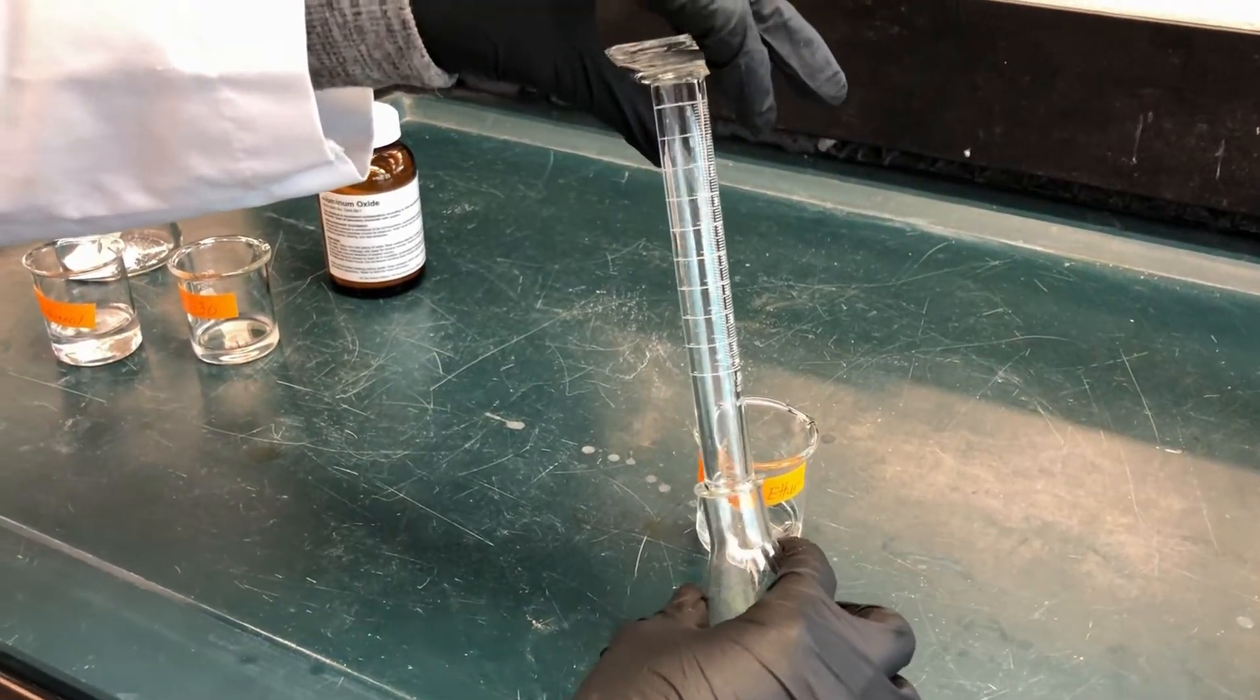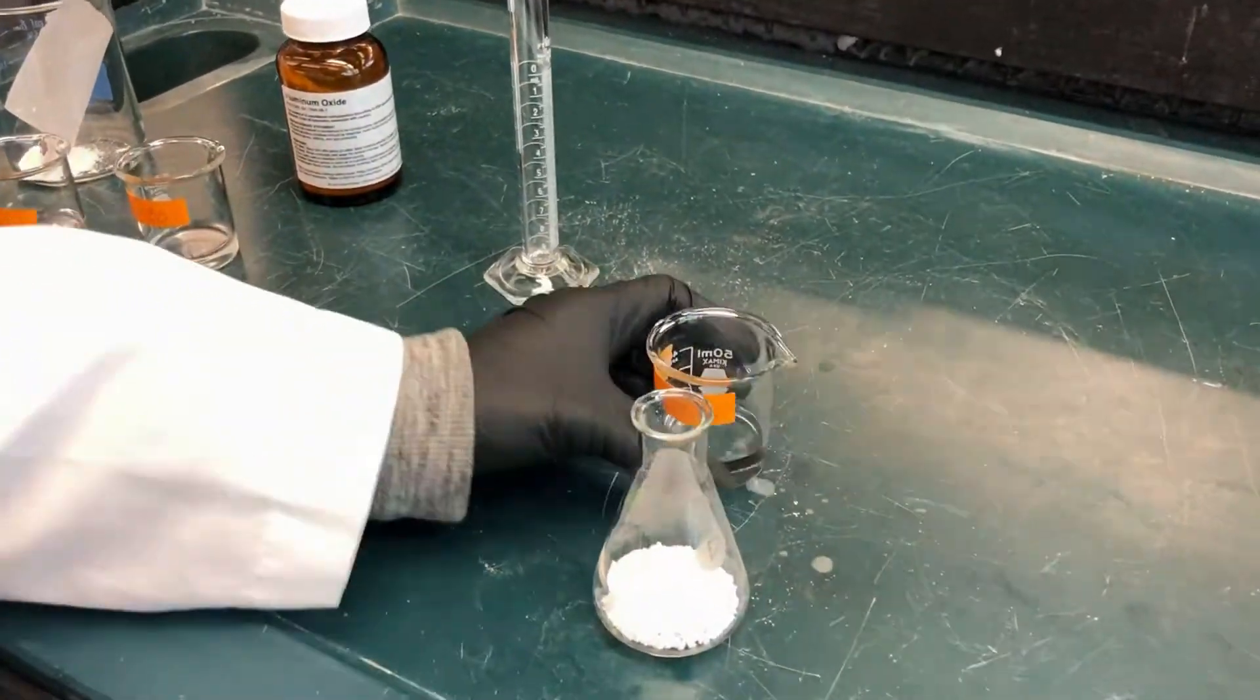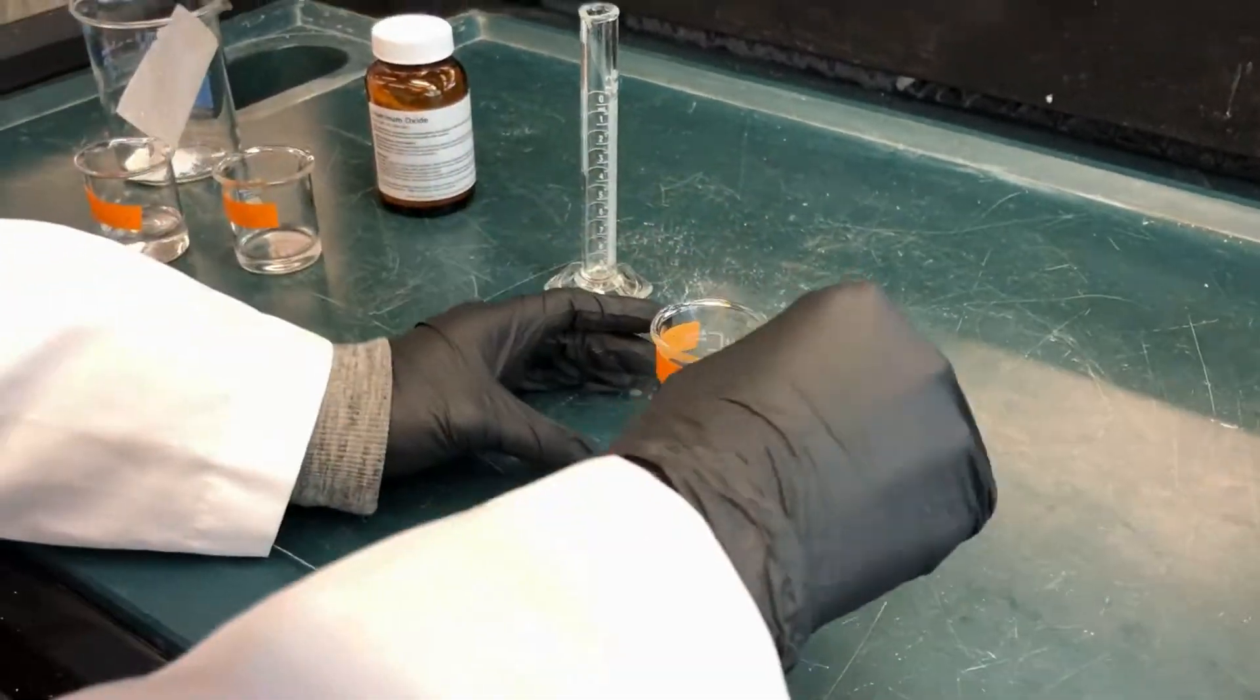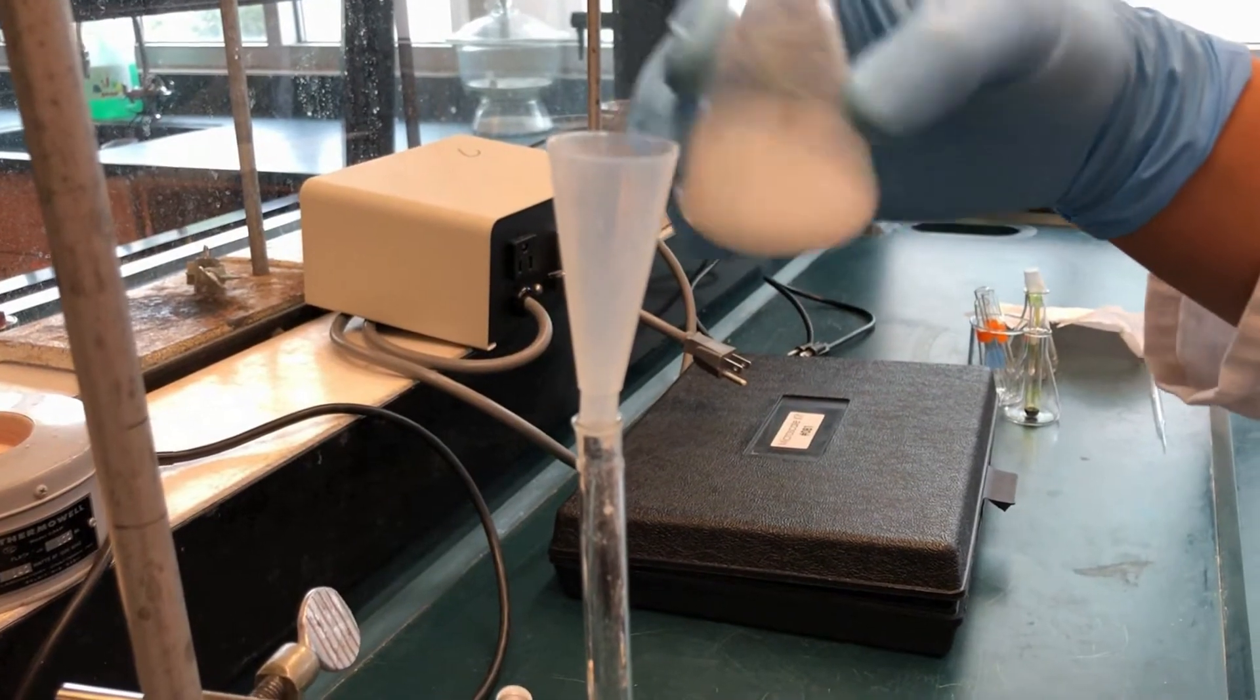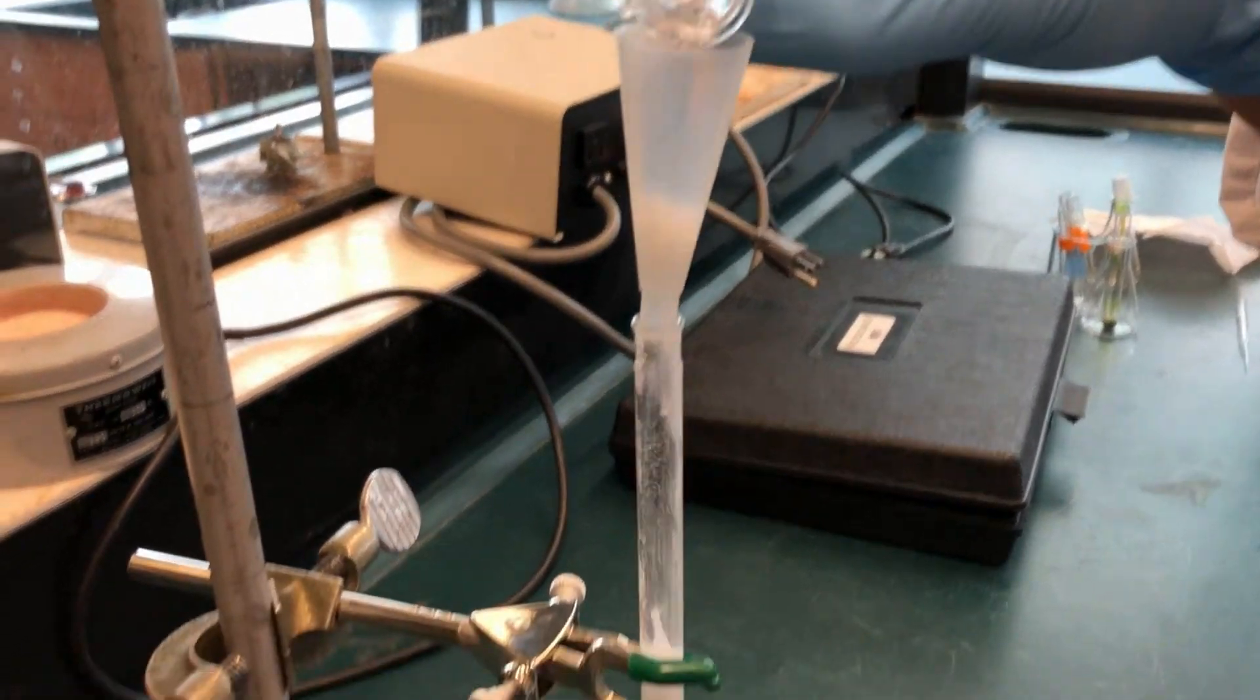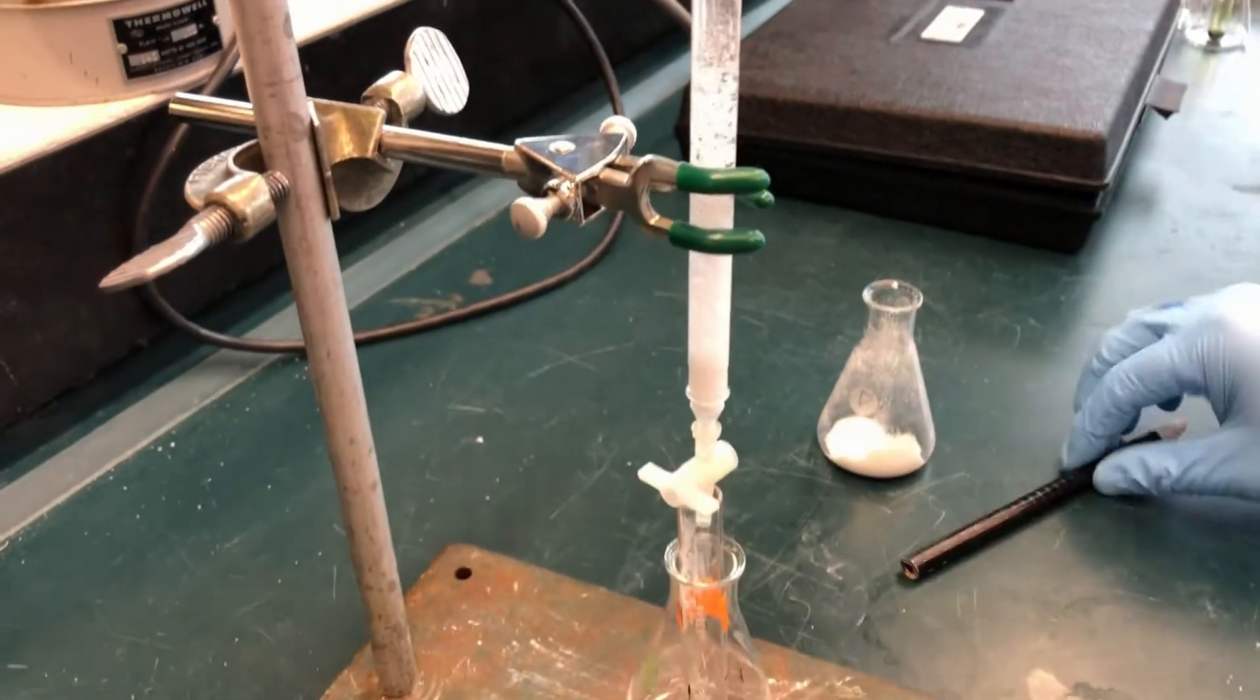Transfer the alumina into a flask. Add petroleum ether and mix. In order to successfully prepare your alumina in the column, pour it into the column while mixing so the solid does not settle to the bottom of the flask.